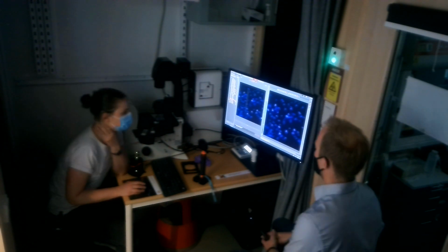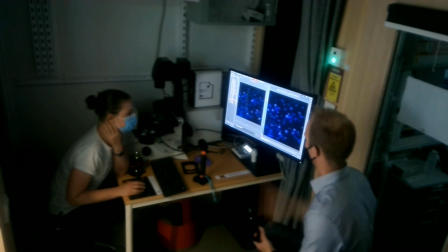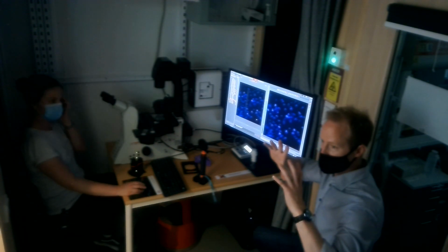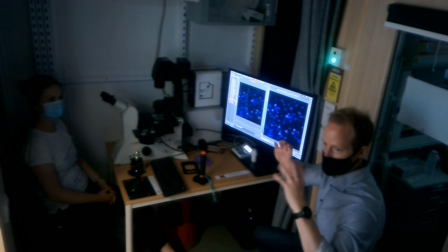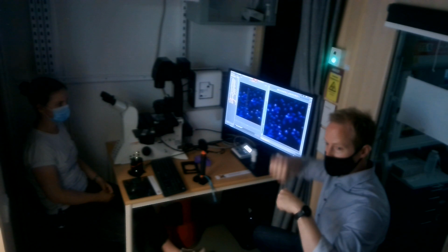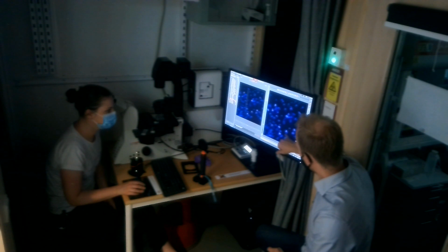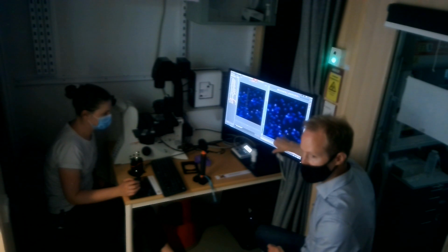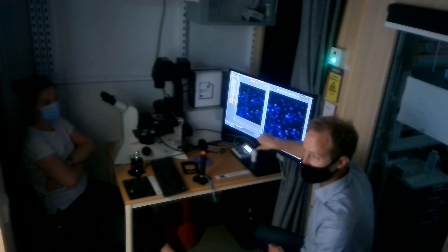This is one way to do it, and this is the one that you would typically use for fluorescence to collapse everything down. It's especially useful if you have something with a bit more 3D structure, and you're looking at stuff that might be in different levels. Say you're looking at cells that are a bit thicker, and you're looking at dots. Some might be here and some might be there. This gets all of them into one image so that you can see it a little bit better. In this case, because you have something very, very bright here, you're quite often getting halos. That's because it's looking through the whole Z stack and taking the intensity of the pixels with the highest intensity.